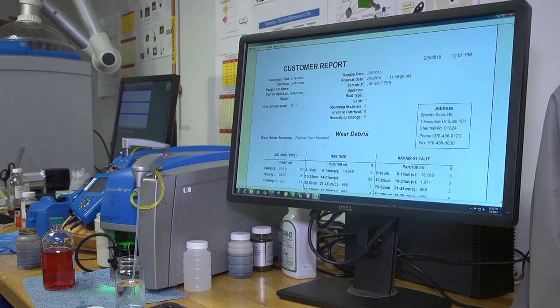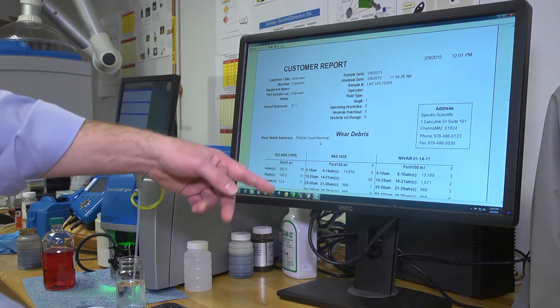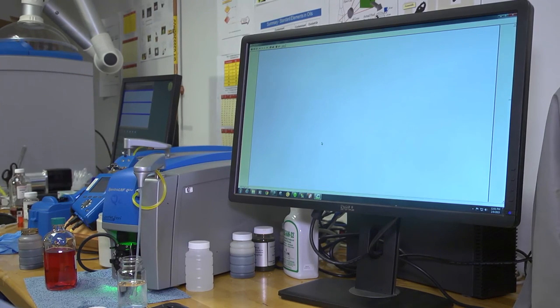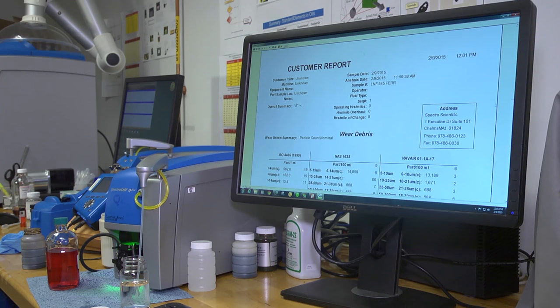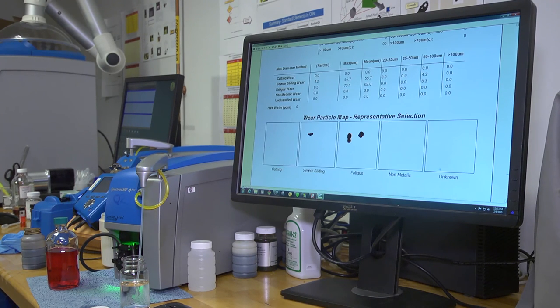And this is a standardized report, which gives you the ISO 4406 codes, the NAS and the NAVAIR codes as well, the particle count and size distribution. Some representative sample maps as well, as well as the distribution of the individual wear counts.